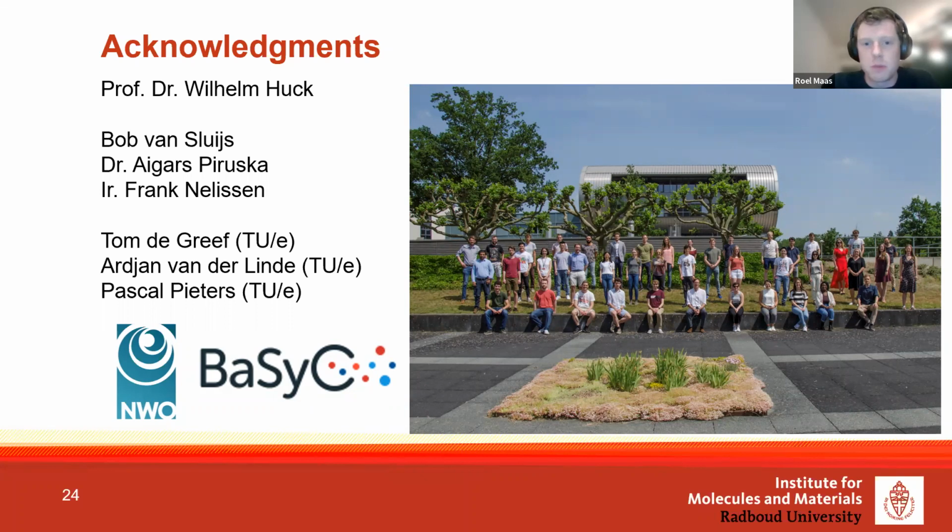You can put whatever in, and whatever changes, if it results in a change in the signal, it will always give you some information, I think. I think the energy dependence is going to be tough, because that's not really part of your model at the moment, right? So that will be a tough one. Temperature on the equations, on the processes in your structure will work. Energy dependence will require expanding the model quite a bit, a bit beyond what we, I think, know how to do at the moment, I would say. Exactly. Of course, you have to include it in the model to get information out of it.